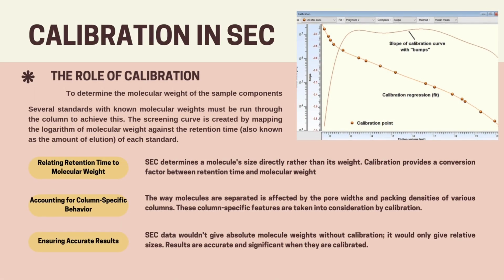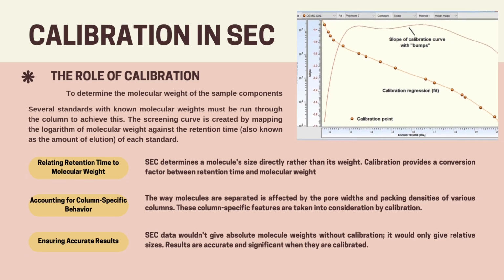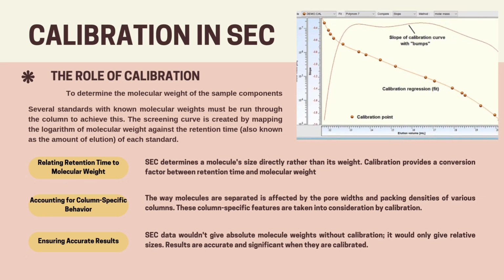Now let's talk about the role of calibration. It's to determine the molecular weight of the sample component. This involves running a series of standards with known molecular weight through the column. The retention time of each standard is recorded and a calibration curve is generated. Why is calibration necessary? It's to relate retention time to molecular weight, account for column-specific behavior, and assure accurate results. Without calibration, SEC data would only provide relative size, not absolute molecular weight. Calibration ensures accurate and meaningful results.